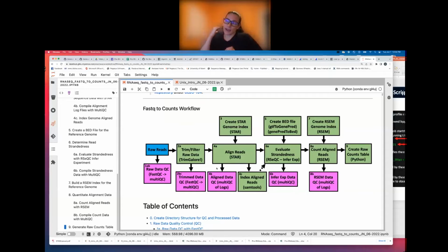We also have one of my colleagues, Jonathan, who has been doing a wonderful job putting together a validation and verification automated program to go through and do automated checks on the outputs of each file, to double check things like when you compile everything into a table, to make sure that it's associating the right values with the right samples from the original genes.results files, for instance. So we are soon going to be releasing that V&V program that anyone could use to check their data.